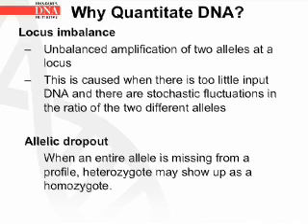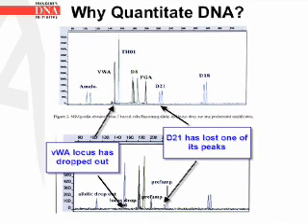Allelic dropout occurs when an entire allele is missing from a profile. This can result in a heterozygote showing up as a homozygote. This diagram shows the same profile — the top part is with the correct amount of input DNA, and the bottom part shows what occurs when too little DNA was input. Here you can see that allelic dropout occurred at the VWA locus and there was a locus imbalance that occurred at the D21 locus.